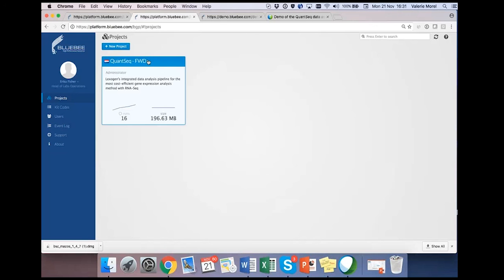So the annotation is very condensed and has not so many different isoforms as in Ensembl. And usually also the 3' UTR is not so well annotated in RefSeq as in Ensembl. That's why we chose the Ensembl annotation.